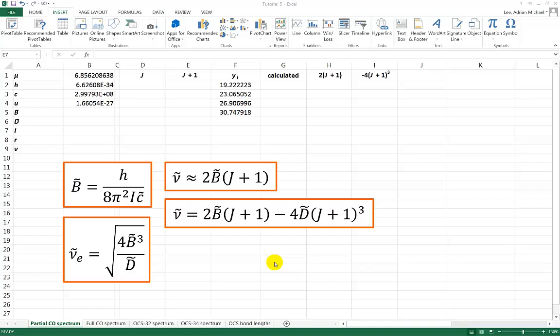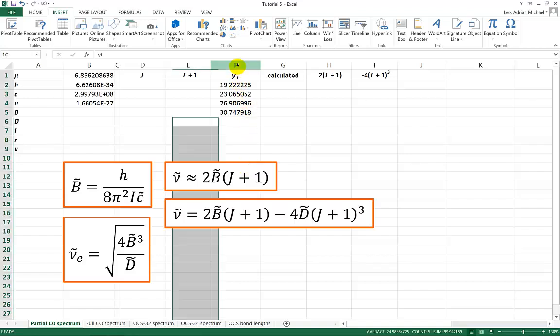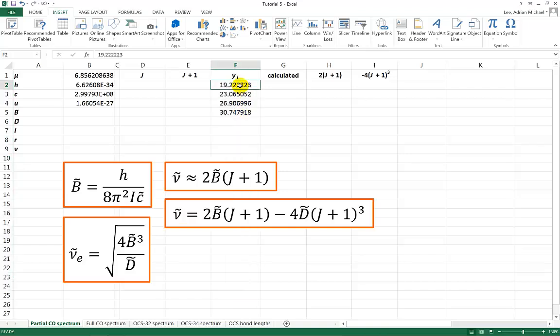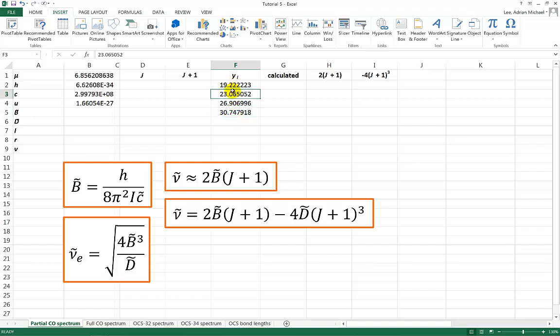Welcome to a screencast of Tutorial 5. I'm going to start off looking at the carbon monoxide data. This is a partial carbon monoxide spectrum. Column F here has got spectral data for four of the spectral lines in the carbon monoxide spectrum. This first spectral line is at around about 19.22 wave numbers. These additional spectral lines are adjacent to one another. And we can see that the difference between any two spectral lines is around about 3.8 wave numbers.